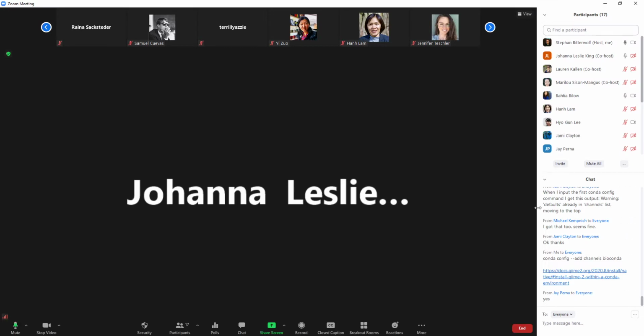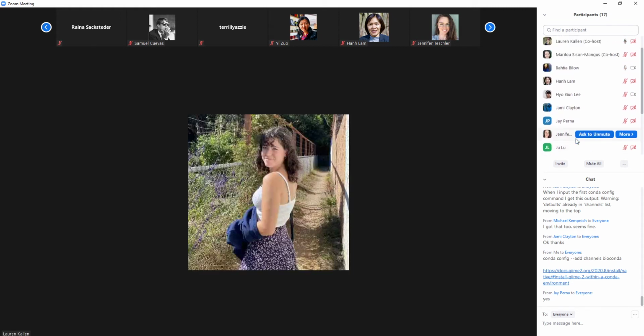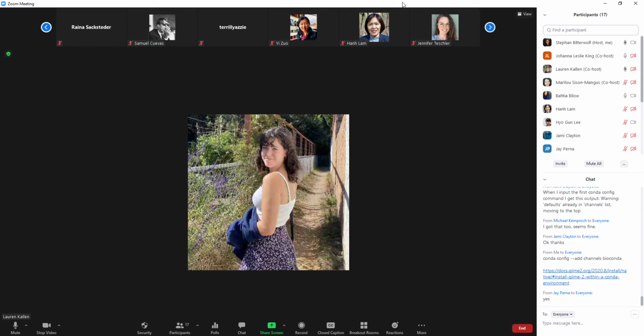Okay, Lauren, how are you doing? Are you almost there? I think I did it, but I'm not sure because I keep getting weird results. I did the channels and then it says command not found. So did you do conda list? Did that work for you? Type in conda space list. Yeah, I did. It says command not found.